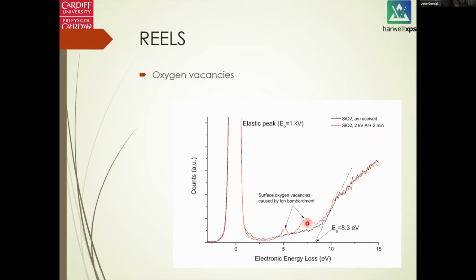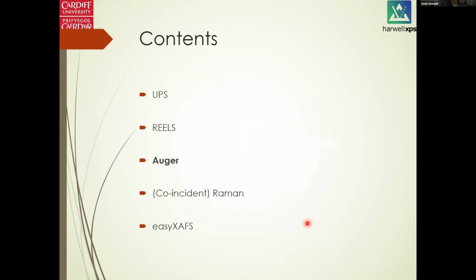And this is a technique that some of you may be interested in when you are about to study the oxygen vacancy catalytic activity for certain materials, because they play quite an important role in the catalytic reaction.